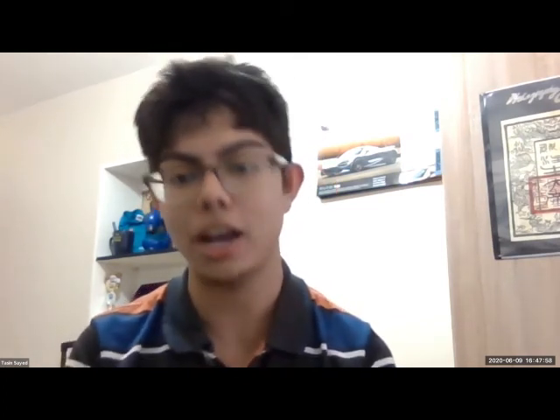Okay, I hope that his question was answered. And we go to the next question by Louis Goodwin. And he asks, how often is IR spectroscopy actually used in forensics? And he mentioned that he'd written an essay on WADA and performance enhancing drugs, where he found out that they mainly used a combination of chromatography and mass spectrometry.